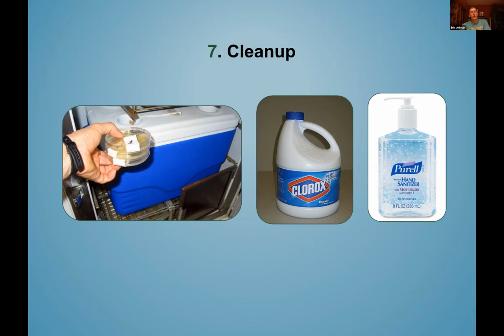And then the cleanup process. The process that they recommend is to use a little bit of bleach to kill the bacteria and then dispose of it. I've had some other monitors say that they seal it up and dispose of it. In either case, that's one of the reasons we're looking at some new techniques that might use fewer materials and put less bleach into the system. But the current system that we use is cleaning it up with bleach.